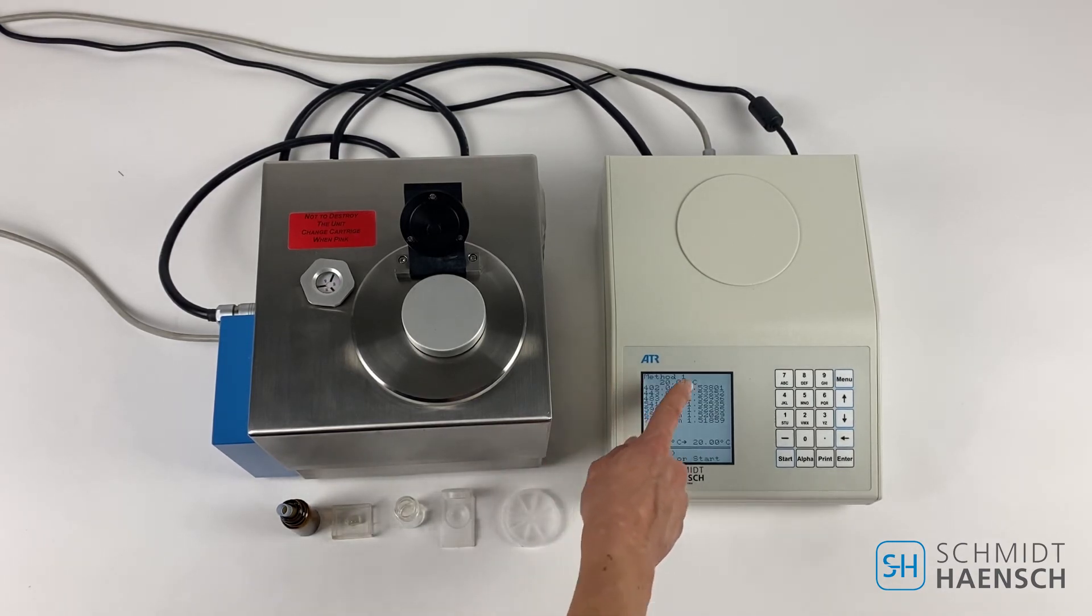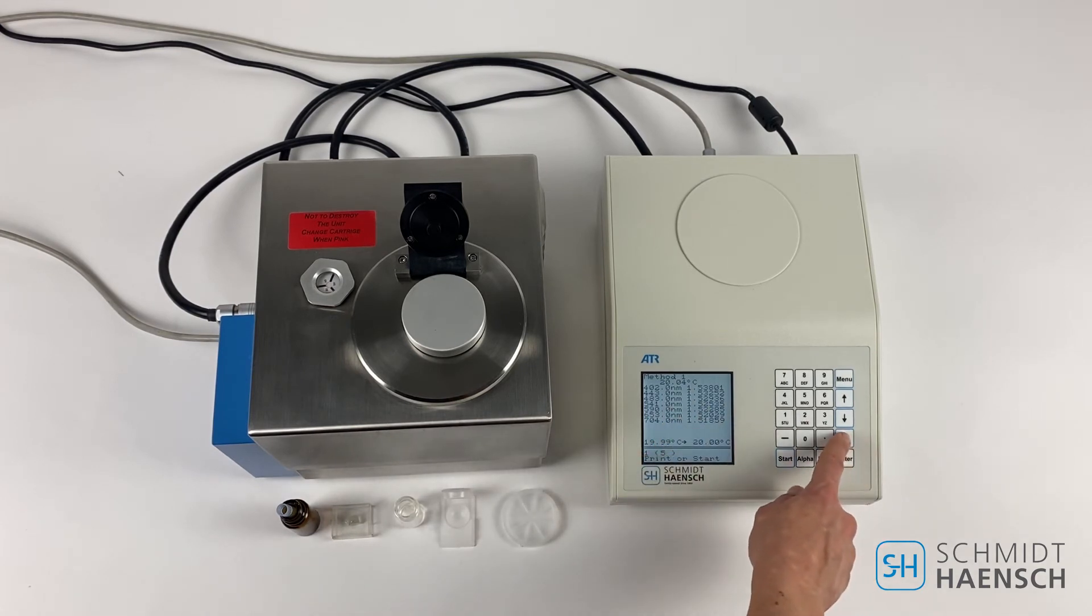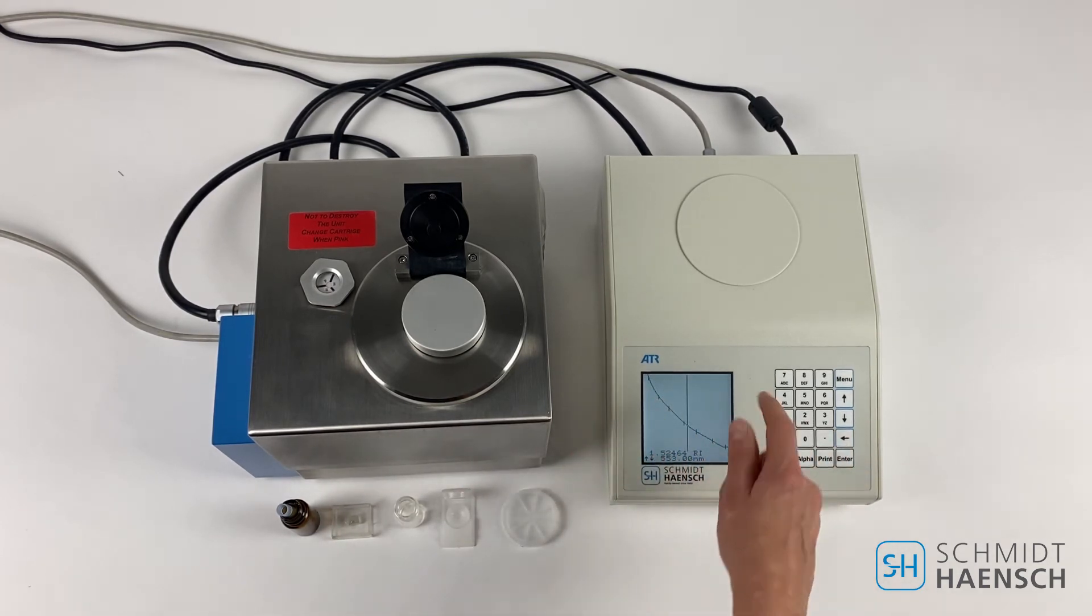The wavelengths are on the left side, the corresponding refractive indexes on the right. To visualize, see the dispersion curve.